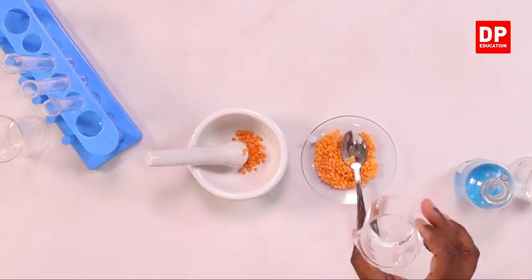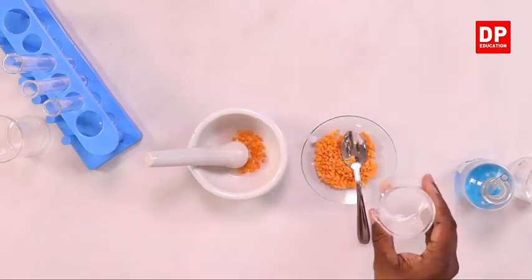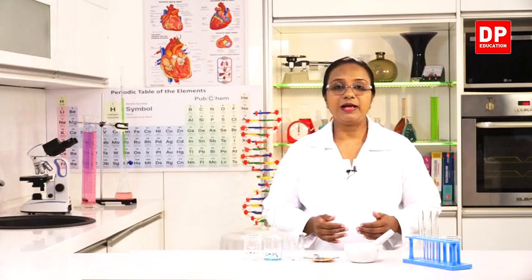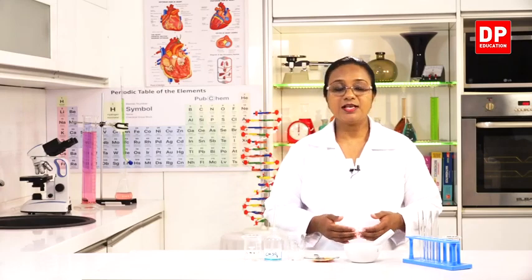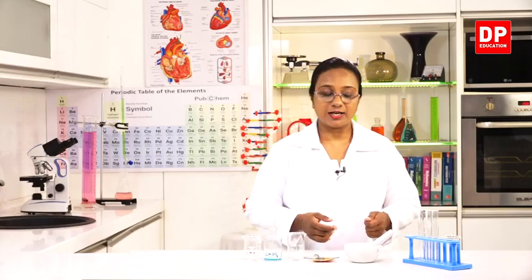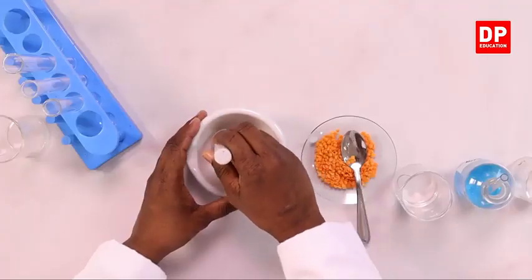And I will be adding a little amount of water to it. I will have to grind it well and get the extract. To make it easier for grinding, you can also soak the dal in water for about 2 to 3 hours. Then it will be softer and easier to grind. So now I am going to grind it and get the extract.